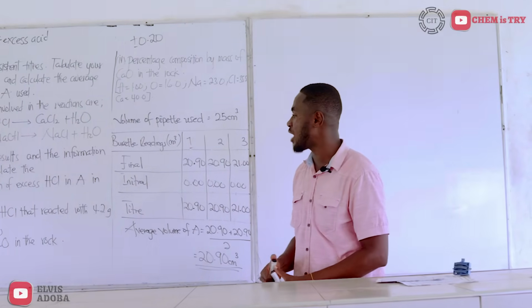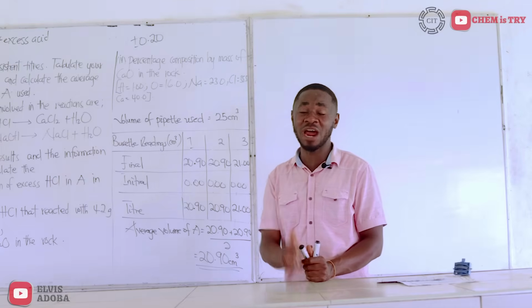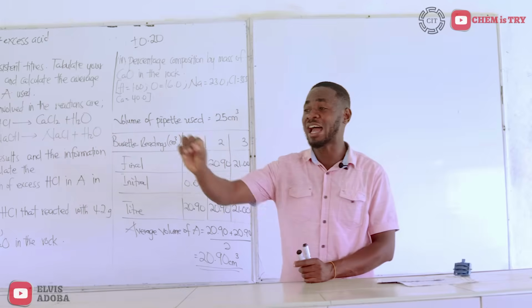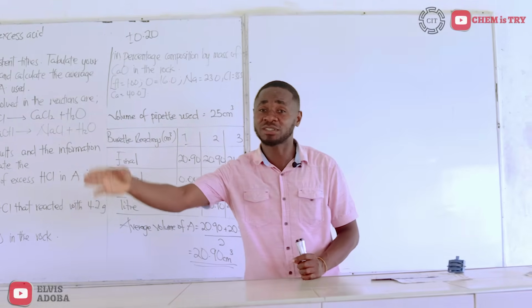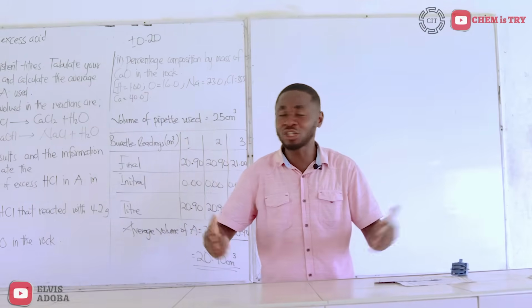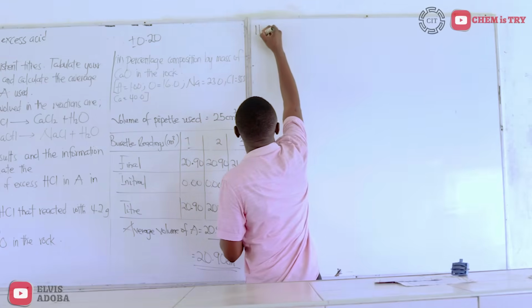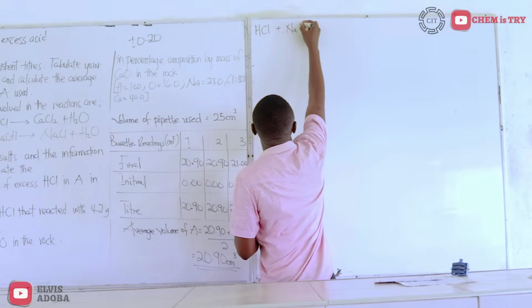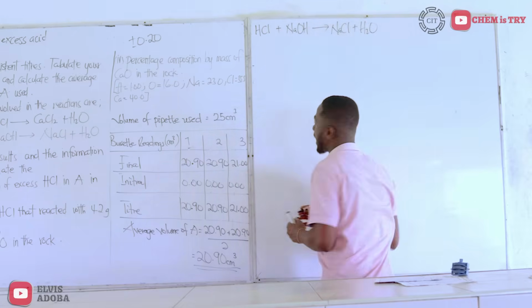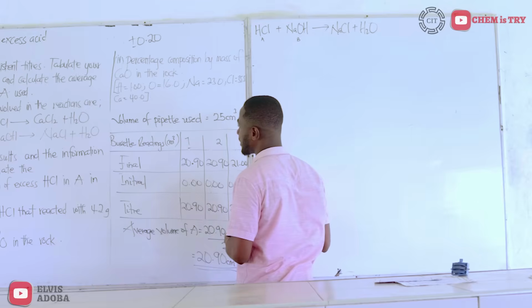We've been asked to calculate the concentration of excess HCl in A in mole per decimeter cube. Now remember, the excess HCl in A is what we titrated with 25 centimeters cube portion of solution B. So to calculate that concentration, we need to make use of our second equation. That is the equation for the titration. And that is HCl plus sodium hydroxide giving us sodium chloride and water. This is our solution A. This is our solution B.